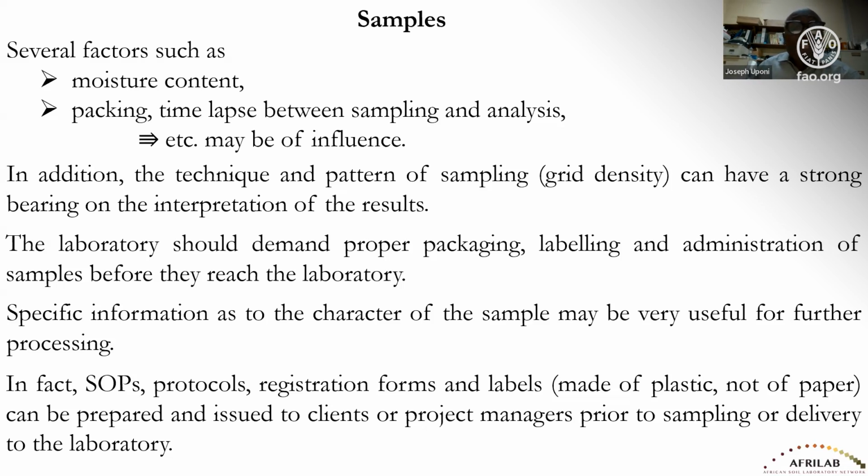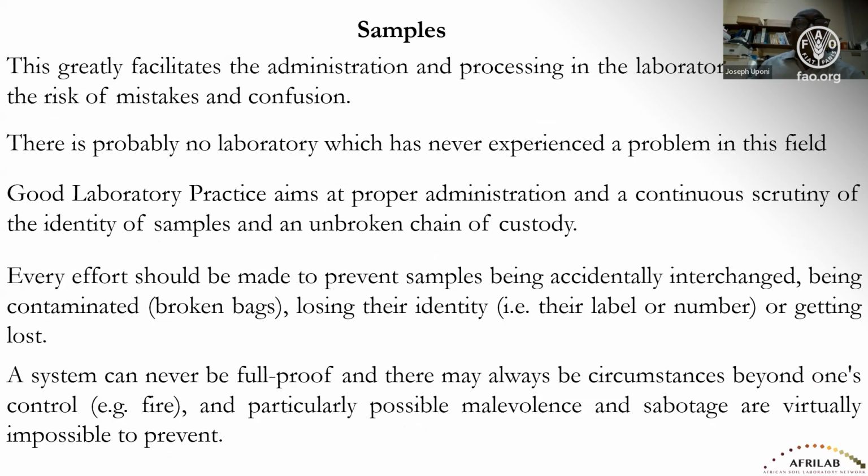The integrity of the sample is so important so that throughout the period of the analysis, you can maintain the integrity without mixing up samples. This is all part of the good laboratory practice that's supposed to go on in the lab. It's a very terrible thing when samples are misplaced or not properly identified. You can imagine somebody bringing samples, some treated with nitrogen, others not treated with nitrogen, and then you interchange the results. The implications are far-reaching. Even though we know that the system may not be foolproof, but that which is within our control, we have to ensure that we maintain the integrity of our samples from the time they come in to the lab till the analysis are completed.